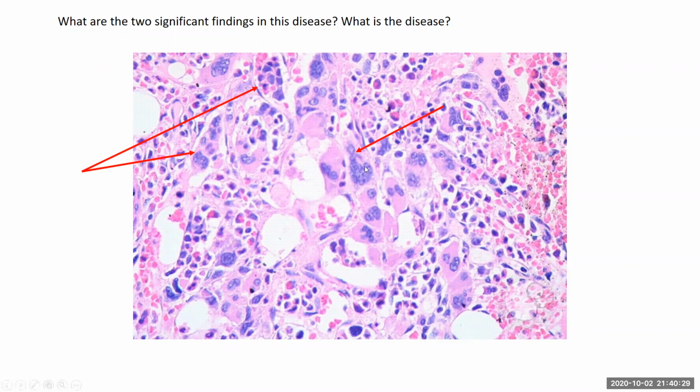Yeah, so atypical megs that have this bulbous cloud shape appearance. And another thing to take away, if say this is 40X, should you see 1, 2, 3, 4, 5 all these megs clustering so close together? And the answer is no. So you guys pointed that out correctly. And then what else? So you see these dilated sinuses. What are they packed with?